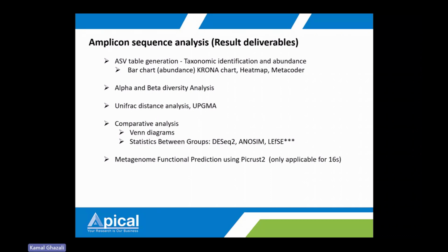All right. Just important notes for the statistics between groups: we need to have two or more groups of samples, because we need to compare the samples, so we need multiple groups. Each of the groups must have at least 3 replicates, because the statistics doesn't work well if you don't have replicates. So we recommend 3 replicates per sample to have good statistics for the analysis.